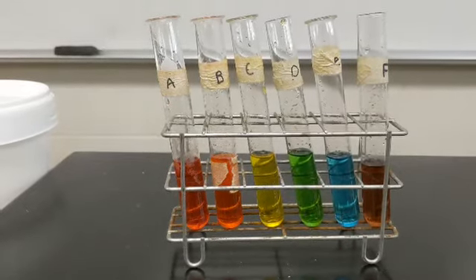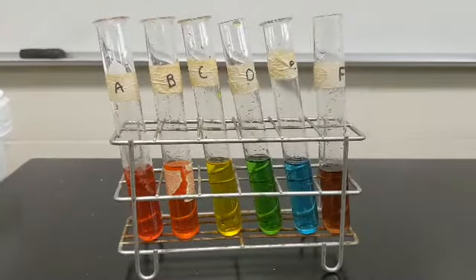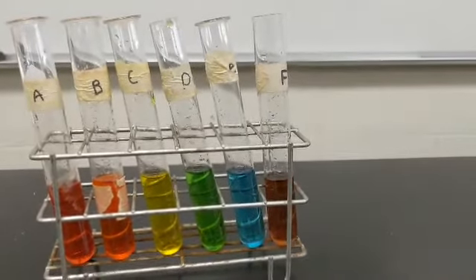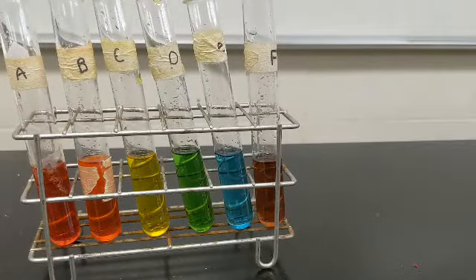C is a pretty clear yellow. D looks green to me. E is blue. And F, it's supposed to be purple, and it's just got a barely purple hue to it here in class.